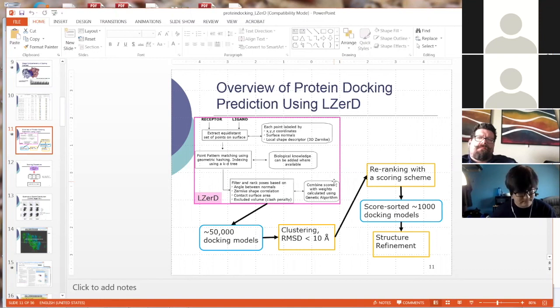Okay. So it's not possible to do it if you just download the package, or if you submit the models to the website. Only shape is considered, but not the physical chemical interactions. So that must apply for post-translational modifications like phosphorylation or ubiquitination or any of that.